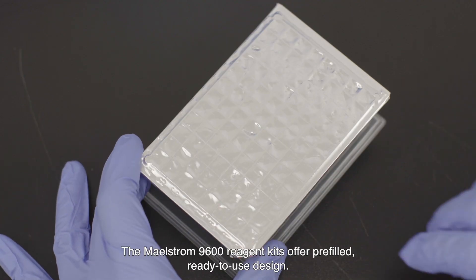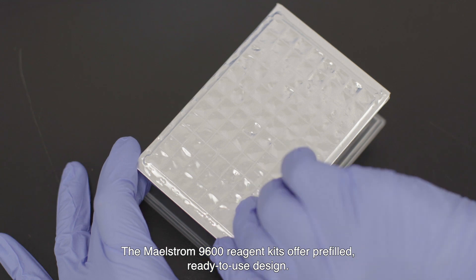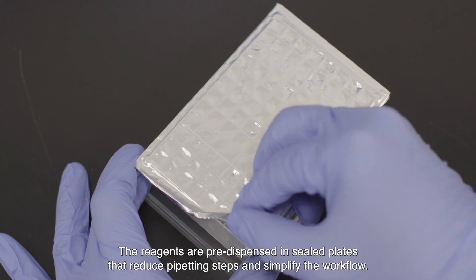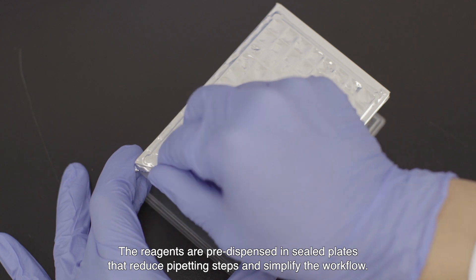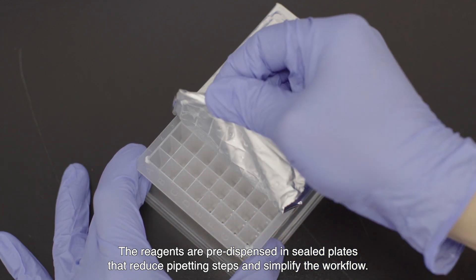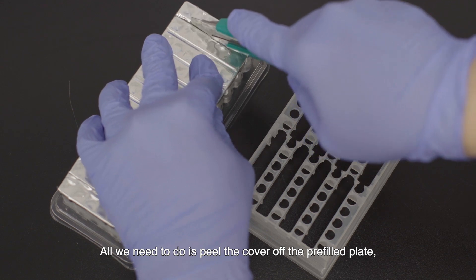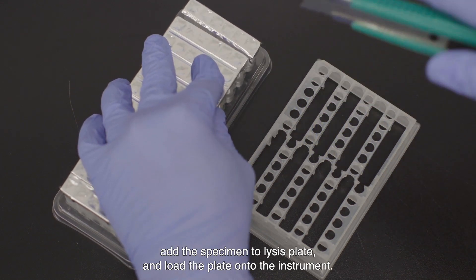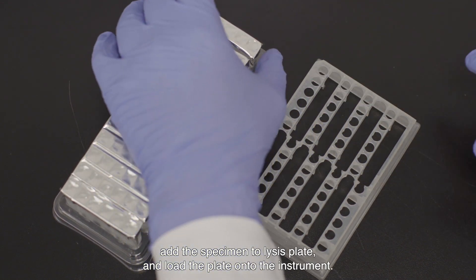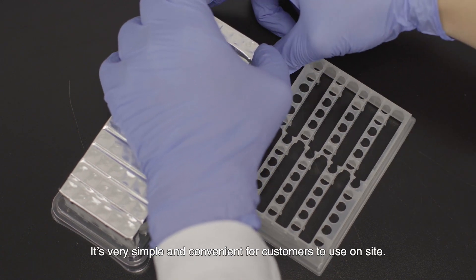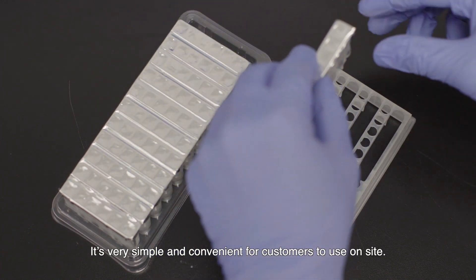The Maelstrom 9600 reagent kits offer pre-filled, ready-to-use design. The reagents are pre-dispensed and sealed plates that reduce pipetting steps and simplify the workflow. All we need to do is peel the cover off the pre-filled plate, add the specimen to lysis plate, and load the plate onto the instrument. It's very simple and convenient for customers to use on site.